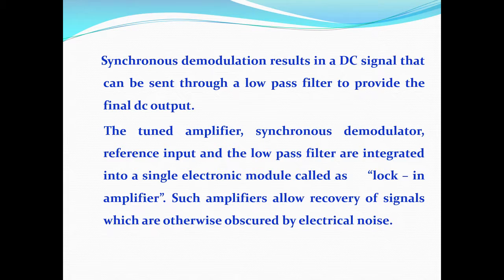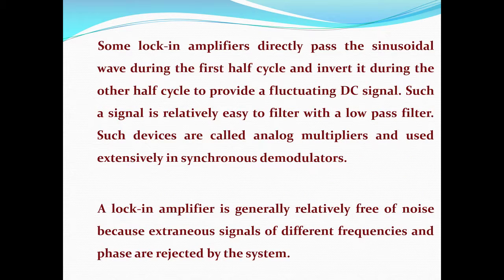Such amplifiers normally allow recovery of signals which are otherwise obscured by the electrical noise. This is an advantage a lot of people claim, but essentially so long as you have the modulation done by a chopper or this lock-in amplifier unit, the result is the same. Some lock-in amplifiers directly pass and others do not. It is generally relatively free of noise because extraneous signals of different frequencies and phases are rejected by the system itself during demodulation. So, this is the advantage.